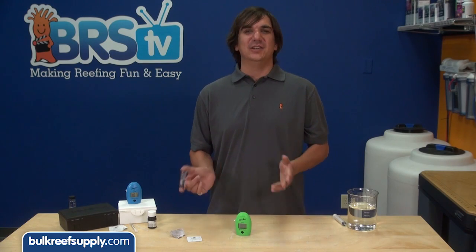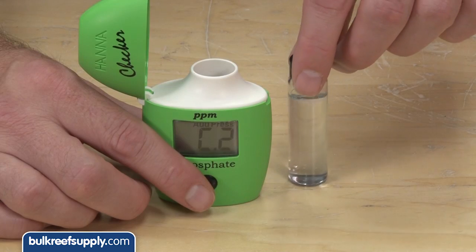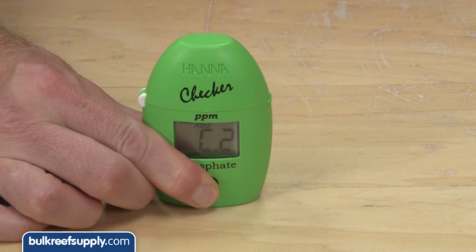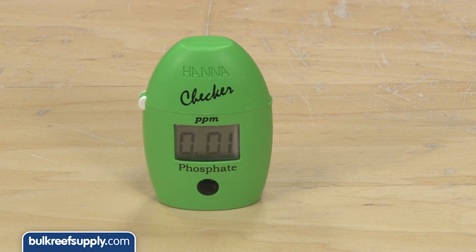Replace the cap and shake gently for two minutes until the powder is fully dissolved. This time when you add the sample there is a slightly different step — rather than simply hitting the button, you hold it down, which starts a three-minute timer. Once the timer is done it will read your tank's phosphate in parts per million.